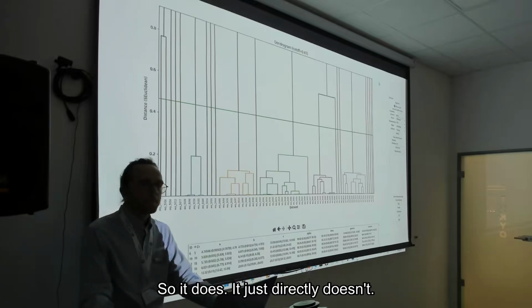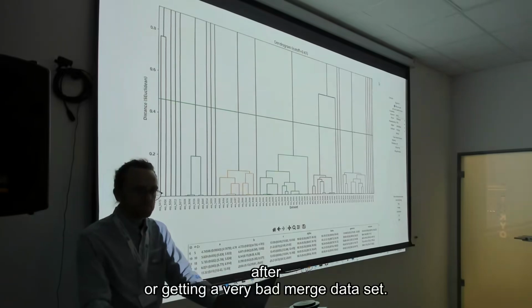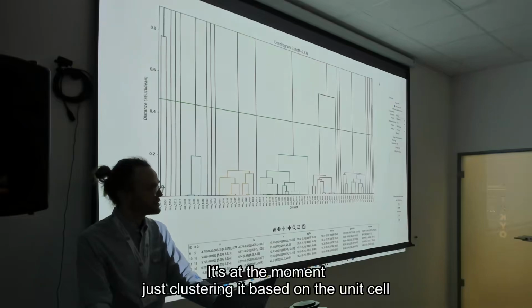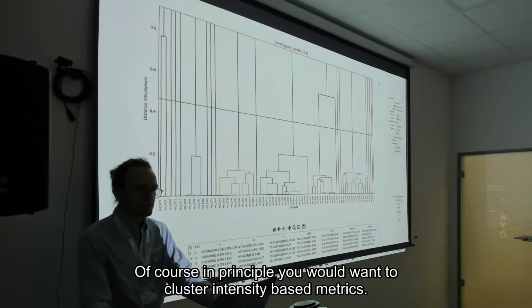So it does it just directly, it doesn't, for example, recognize if it is a very bad crystal, or after getting a very bad merged data set, go back and revise this? No, it's at the moment still in a very, very simple stage. It's at the moment just clustering based on the unit cell, which is also not optimal. Of course, in principle, you would want to cluster on intensity-based metrics.